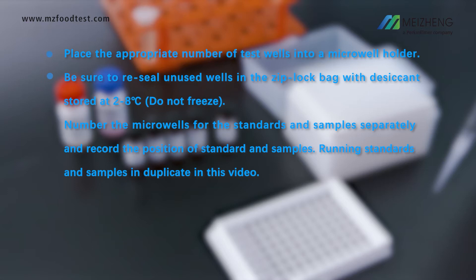Place the appropriate number of test wells into a microwell holder. Be sure to reseal unused wells in the Ziploc bag with desiccant, stored at 2 to 8 degrees Celsius. Number the microwells for the standards and samples separately and record their positions. Run standards and samples in duplicate.